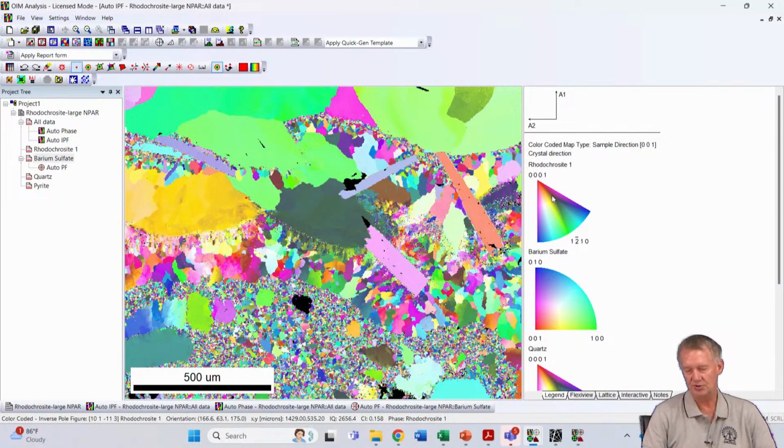So for the first two, I can't say, I don't even know what they were. We'll just call that rho and we'll call that barium something. Okay, so this is showing 010, which is different than 100, which is different than 001, but it's in this square.